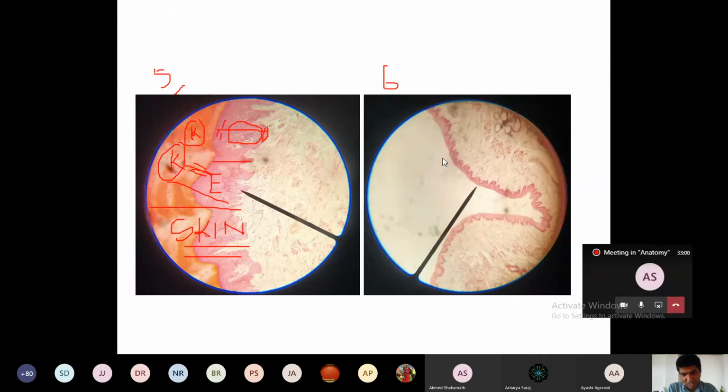Isn't it? And then distribution. Can you tell what is the distribution of this one? Where is it lying? Shishir: Thin skin. Better to go to a clearer point. You can give the example of the esophagus. This is actually not the slide of the thin skin. You see this type of epithelium in the thin skin, but this is not a section from the thin skin. This is from the esophagus. In the thin skin, I'll show you later towards the end of our session today.